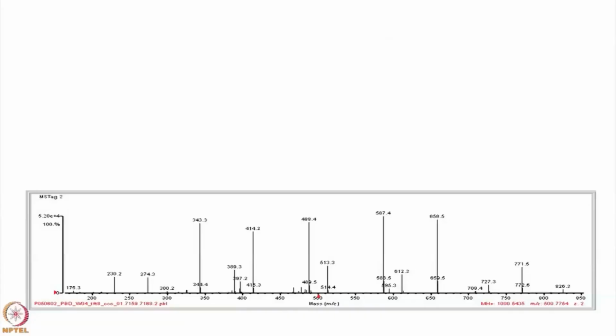Some software packages will strip out the charge. I think that's silly, because we measure ions, we don't measure masses. Furthermore, when you're dealing with high accuracy masses, you have to trust that they have built it to subtract the right amount, because it's not 1.0. It's 1.0078 minus the mass of an electron. And these things matter. So I think it's easier just to think in terms of ions, so I keep the charge. Those are the useful things to know. What kind of spectrum would you call this?